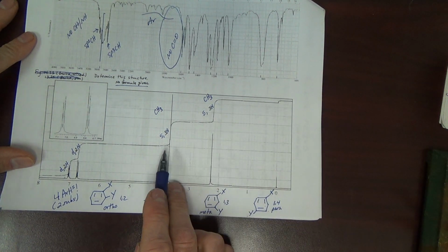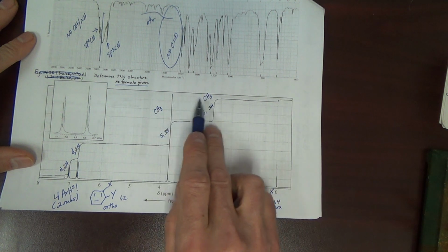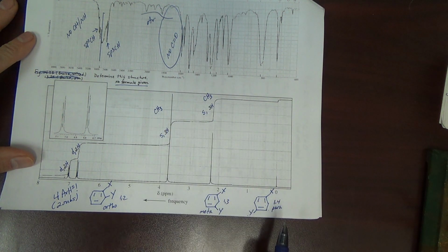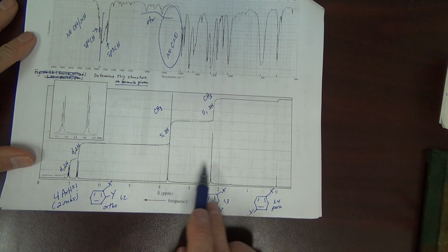But we have to recognize these two methyls are not the same. That is, they're not the same by symmetry. Because they're giving two different signals.